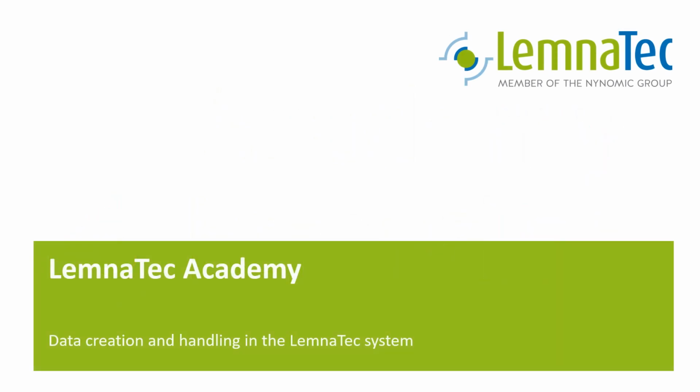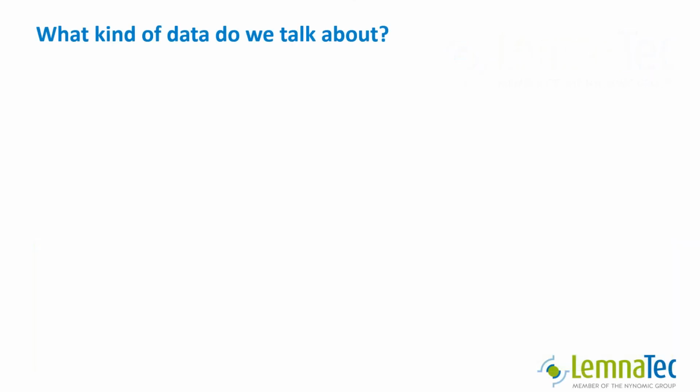In this video, I will talk about a more technical yet important aspect of the software: the different types of data we deal with, when they are created, and what purpose they have. In the LemnaTec system, a lot of different data is created while you are using it.